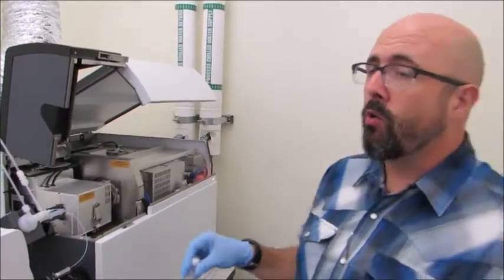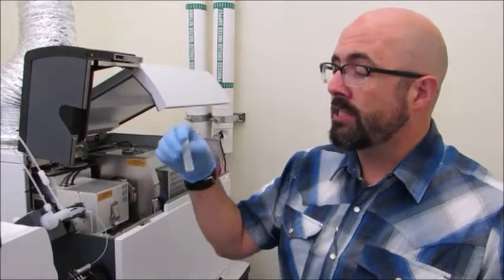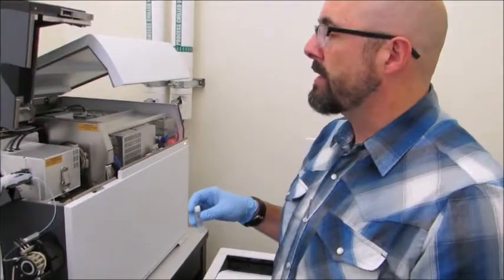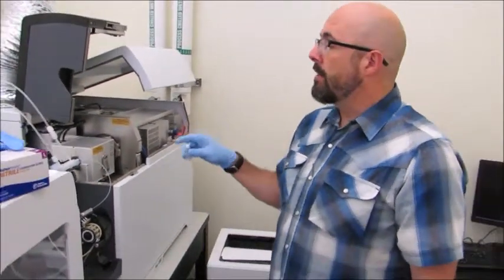These machines are incredibly quick. We can measure this sample thousands of times, which is how we do it for counting statistics, in about 2 minutes. It will measure the entire periodic table for us for the most part. It won't do gases, but it does most everything else. But it's also incredibly precise.